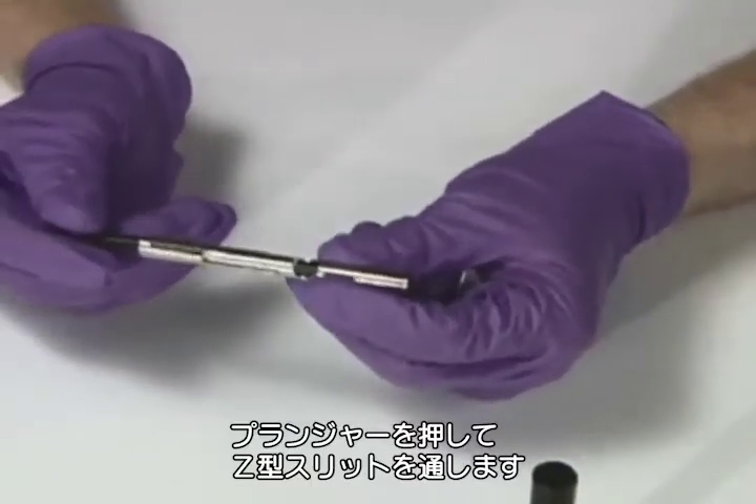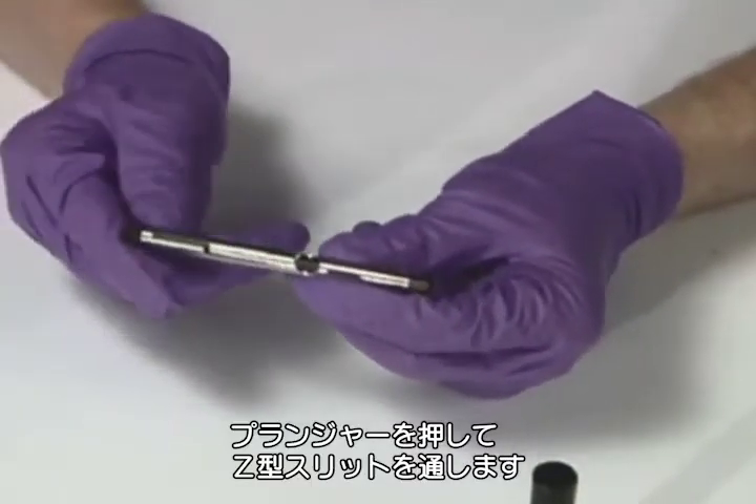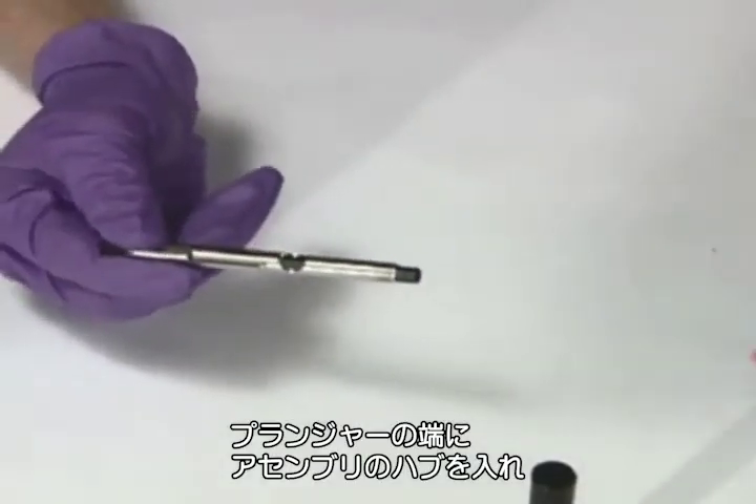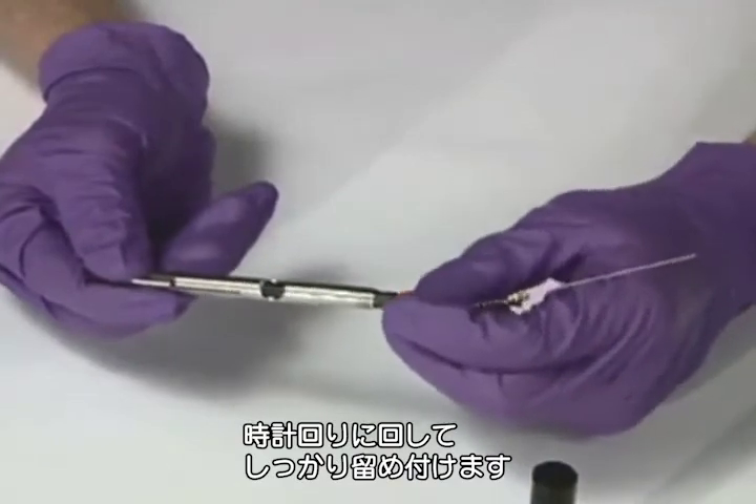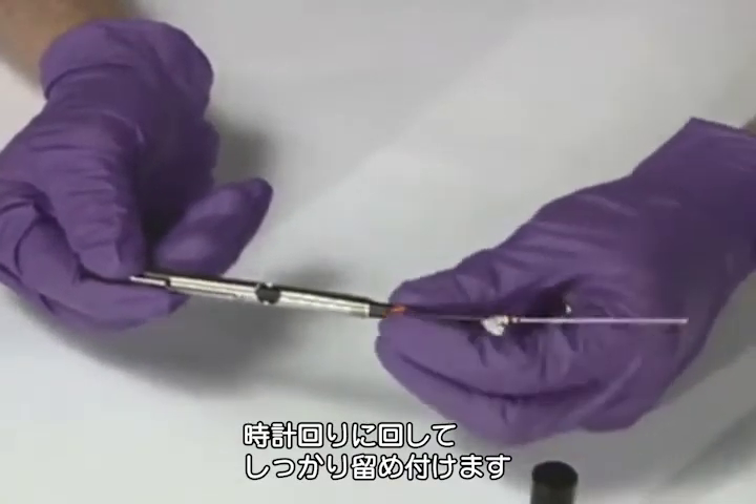Push the holder plunger down through the Z slot until it stops. The threaded fiber assembly is screwed into the barrel of the holder by inserting the thread end into the plunger and rotating it clockwise until it is snug.